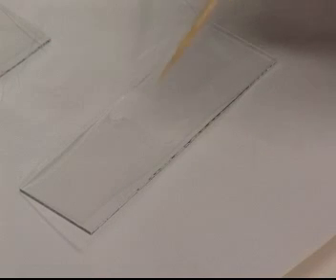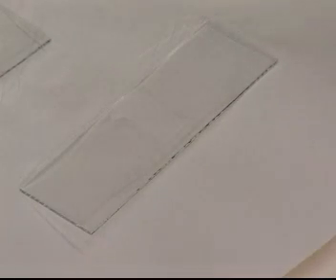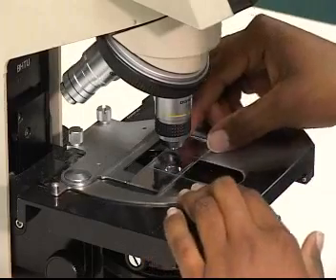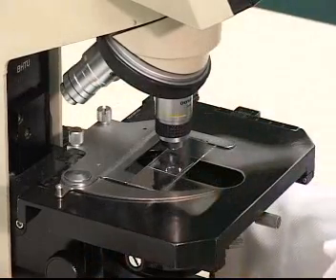Now, place a cover slip on the specimen as we described when making the onion slide. We can now examine the slide under the low power and then the middle power objective. Are the parts of the cells clearly visible? Again, as with the onion epidermis, you will not be able to see all the parts clearly since the slide has not been stained.